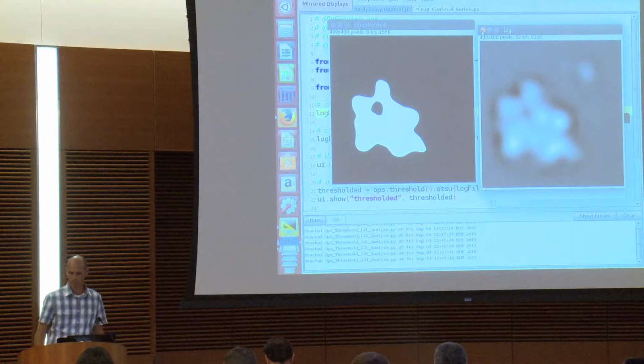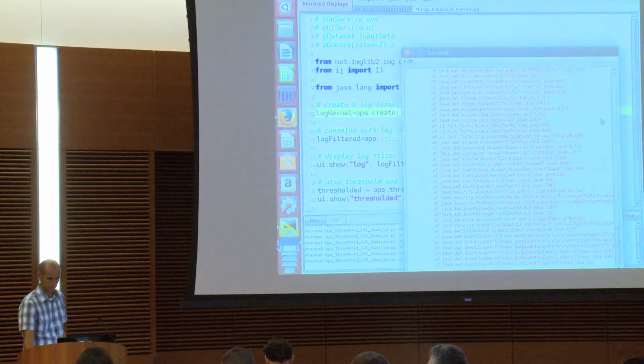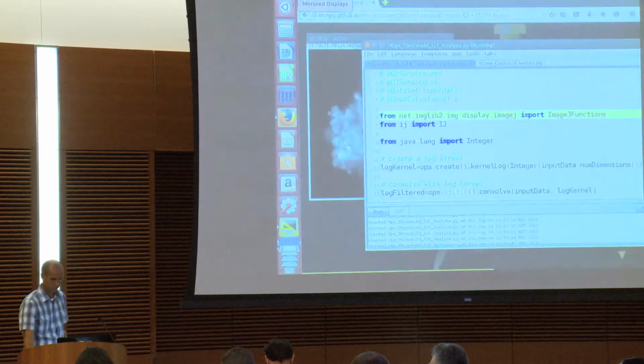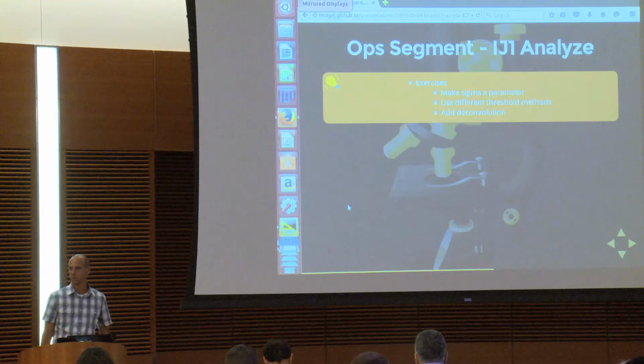So at the moment, I would recommend still using that dial. Another way of doing it would be to write a second script and call that script, just for the most super complicated cases.